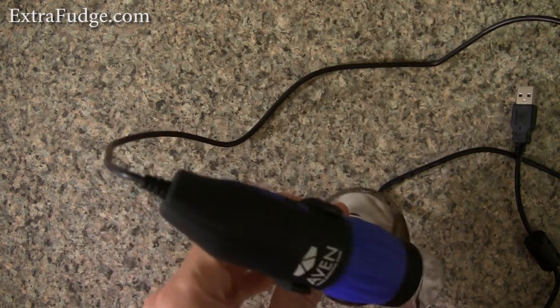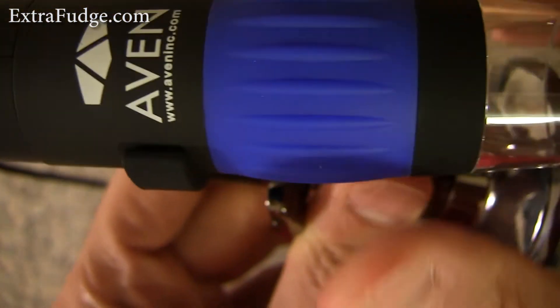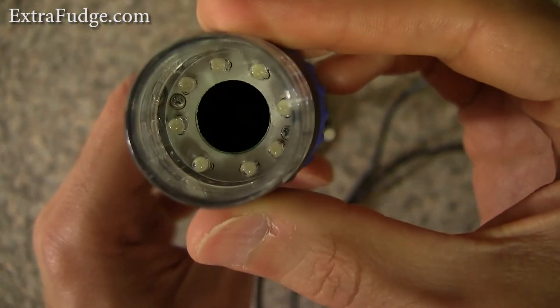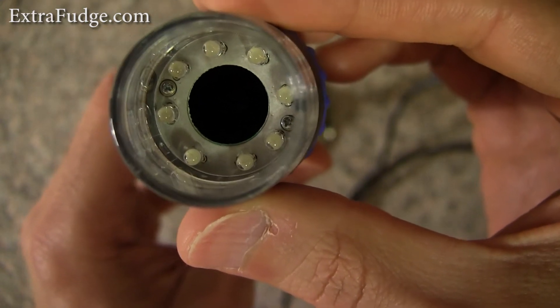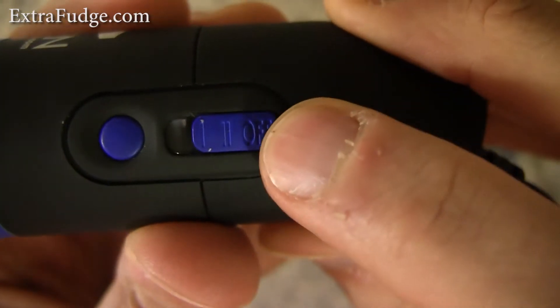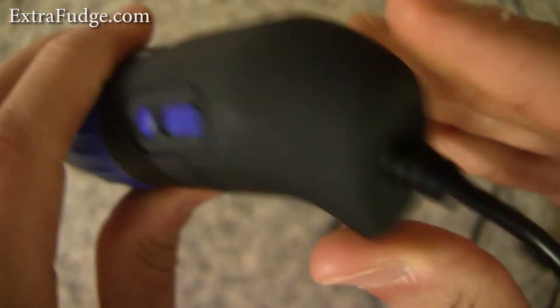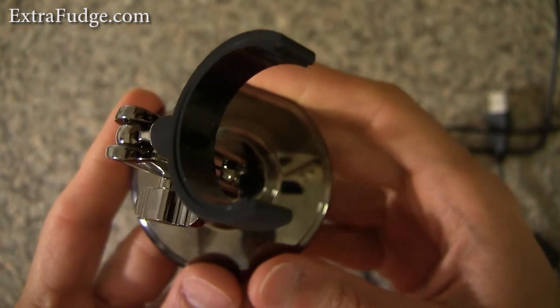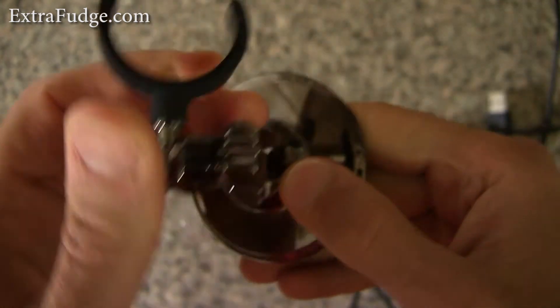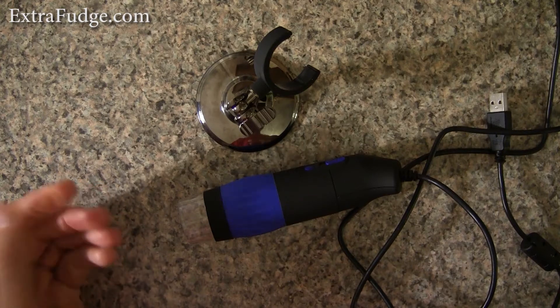Let me show you some macro shots of this microscope. This is the top, and this is the ring. There are eight LEDs with three intensity levels — eight working at full, four at half, or none at all. There's a button to take a photo. The stand is made out of metal with a nice metal screw, built very well, and it has a nice foam base that is really non-slip.